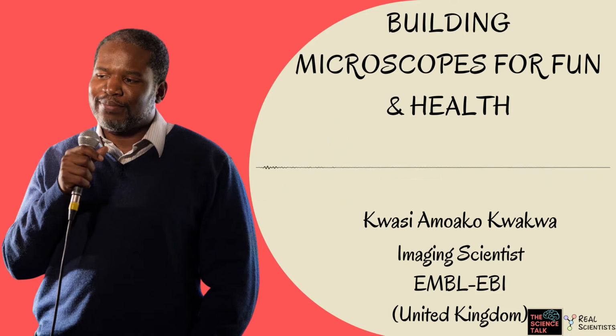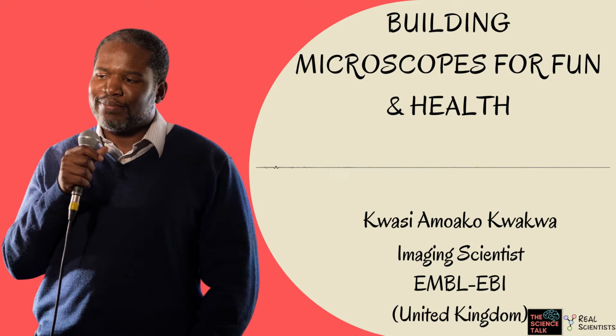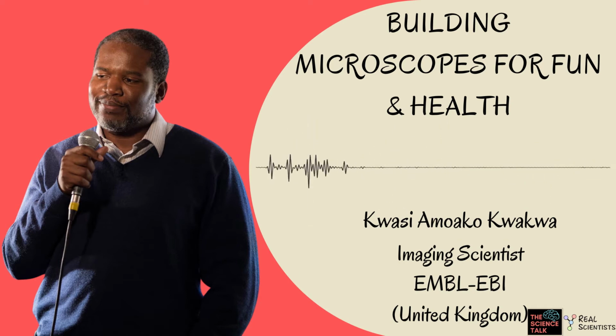You can't tell that by just sequencing the entire kidney, but you can if you take a slice of it, stain it so that you have fluorescent molecules that attach to the active genes inside the cells, and then put that in the microscope. The microscope can go along and read that and tell you which cells and which parts of your kidney are doing what kinds of activity.